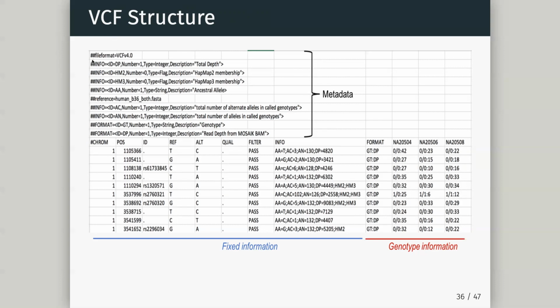Also notice we have our comment characters here. Right, we have one hash here, right? So if we did the read delim, it would ignore all these lines if we just read this in. And that's deliberate. They're following a convention here. And they're following an interesting convention where they will have two hashes for lines you definitely want to ignore. But the header line has a hash as well, but just one hash. You can actually distinguish between the two. I might not want to read in the header line, I know what I have. Or I do want to read in the header line, but I don't want to read in this. You can control that with different comment character settings.